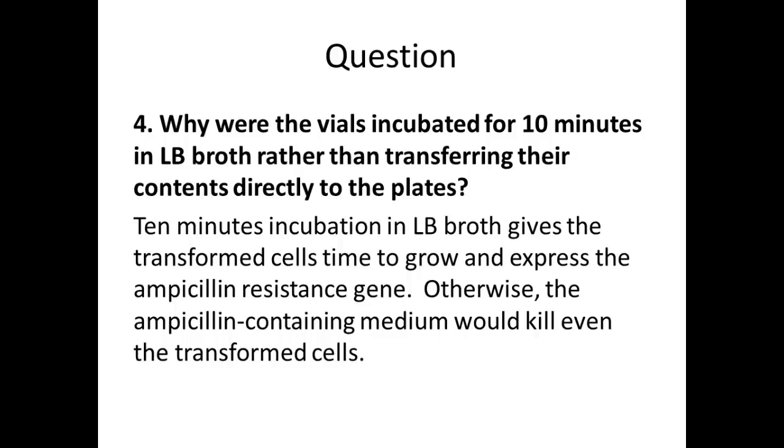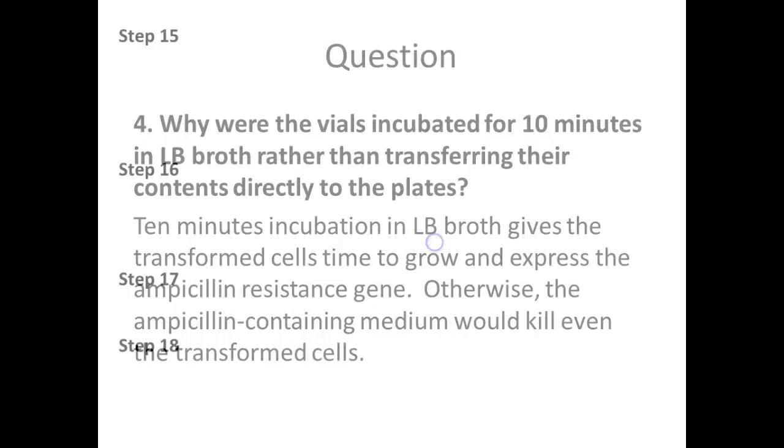So it's actually going to stop it from expressing it. But it is definitely going to express the ampicillin resistance gene, BLA, the beta-lactamase. And in fact, we need them to do this because the next step is going to be plating them onto media that contains ampicillin. So if they don't make it, what's going to happen? They're going to die, right? They've got to make this stuff.